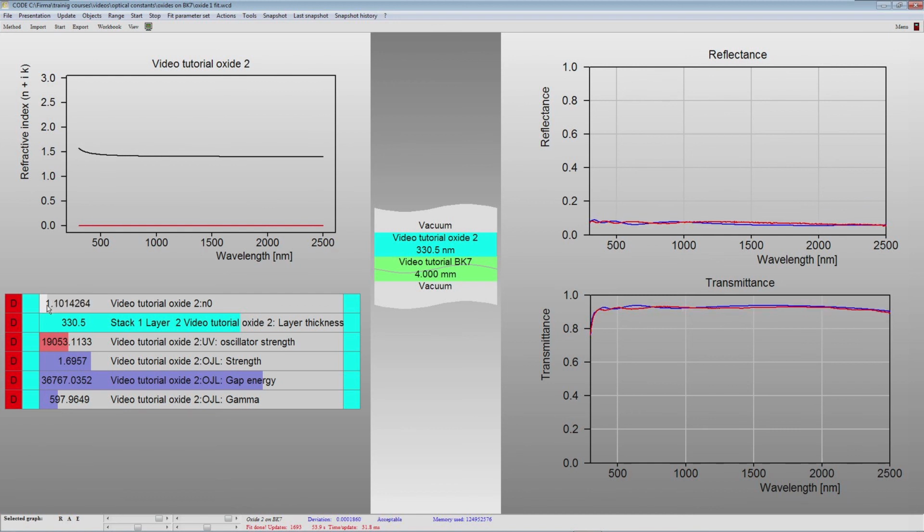So now if I tune this more or less carefully, we have in between a situation where we don't have any structures here, any interference pattern. Now we have defined optical constants which are almost the same as BK7. And if we go to smaller values, you can see that the minima now go down below the level of the pure substrate. So we can increase the thickness now and get a rather good agreement almost everywhere.